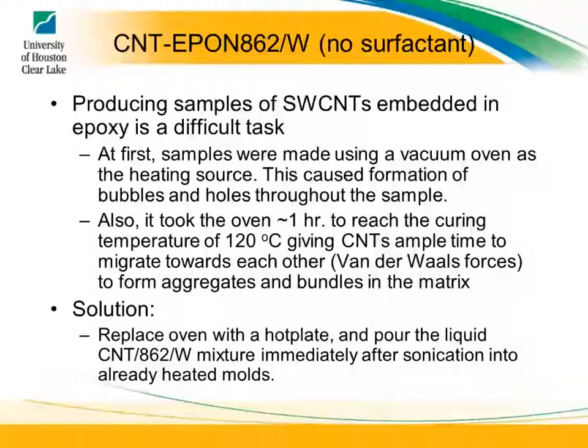So I moved on to this material without a surfactant. We were making samples using a vacuum oven, heating it up to 120 degrees. After 1 hour, the viscosity drops incredibly, and aggregates started forming. So our solution was, let's get rid of this vacuum oven.